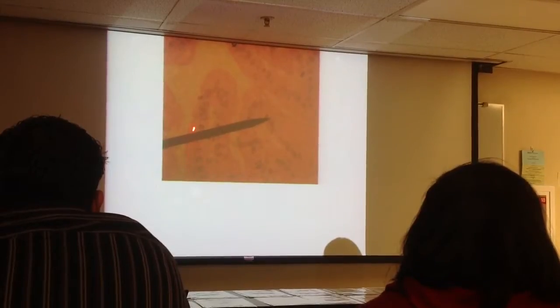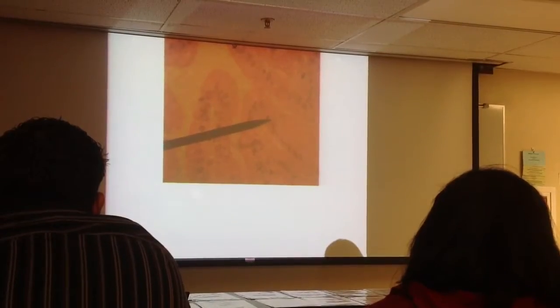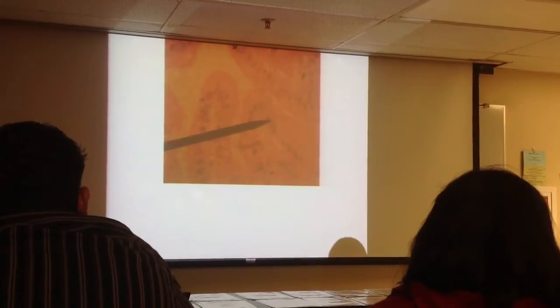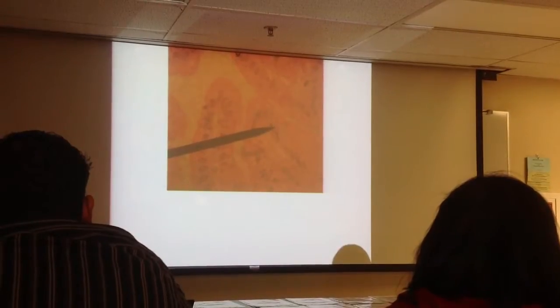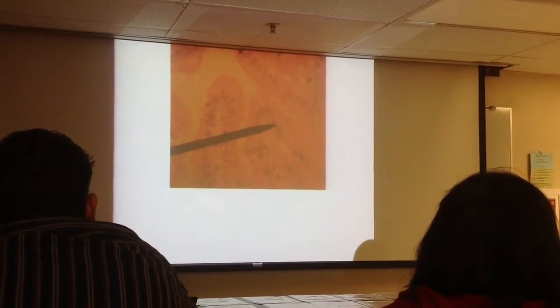What type of tissue is this on the outside? Simple columnar ET. Okay, so now the nuclei are pressed side to side. Organ? Small intestine. And I have the low power on top and then the higher power. And actually, in one of these areas, you can kind of see it better on the picture I have.